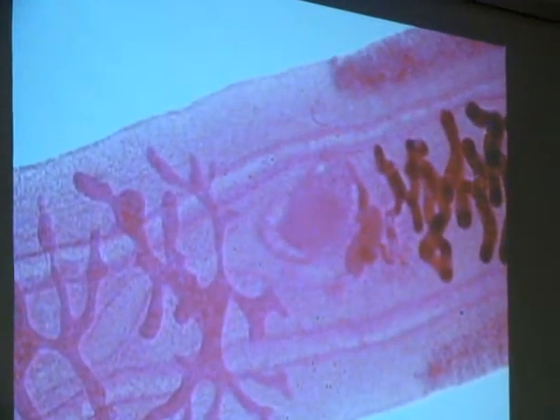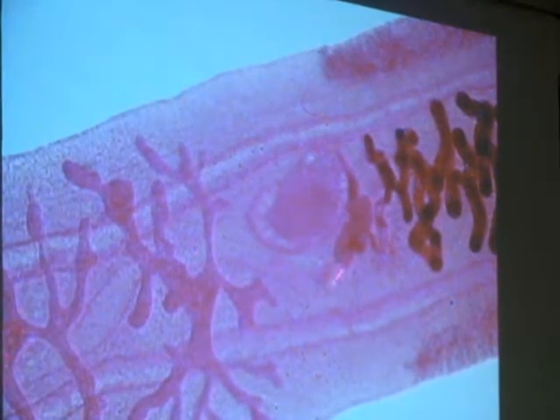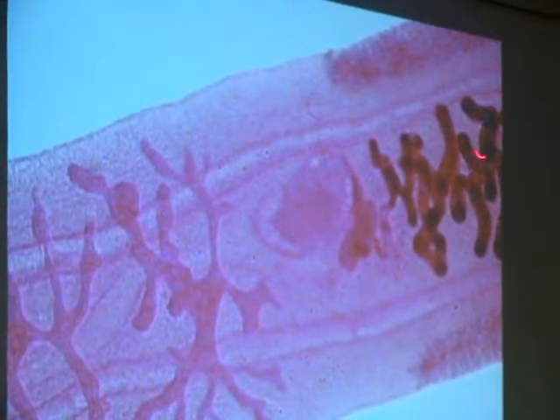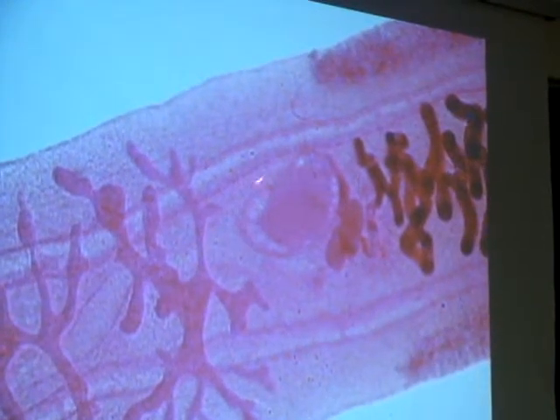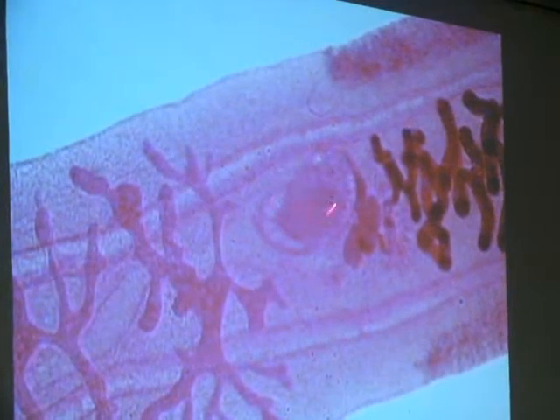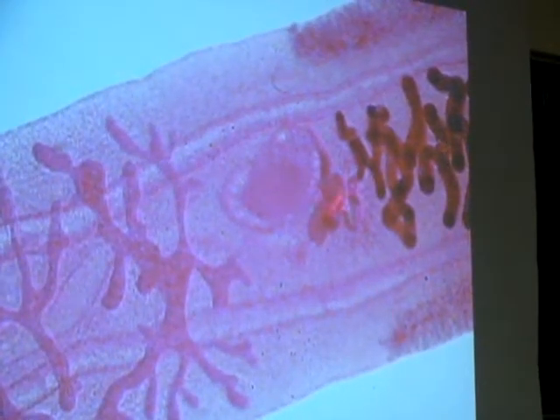The pink kidney bean, seminal receptacle. That makes this puffy business the ovary. Yeah, the ovary's the hard one to see. So you got your major parts, the ones that are simple, uterus and testes. The two that are harder, seminal receptacle has a kidney bean shape. Colors are variable. Sometimes they're dark, sometimes they're light, sometimes both, like this one is. And then whatever shape this puffiness is between this object and that object, that is the ovary.